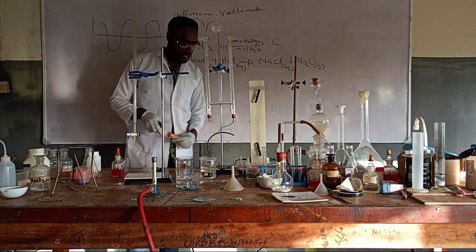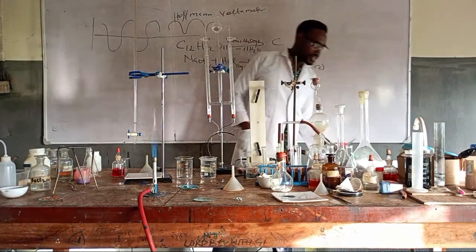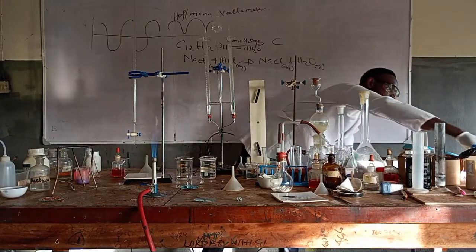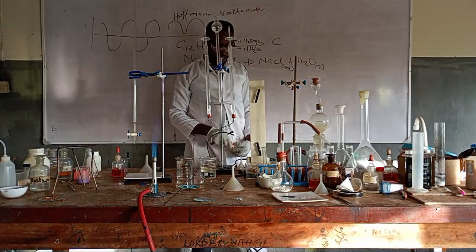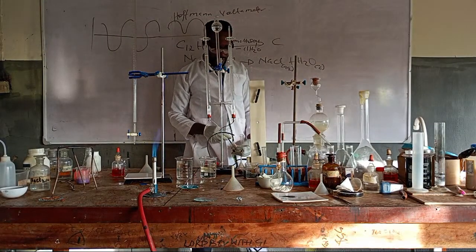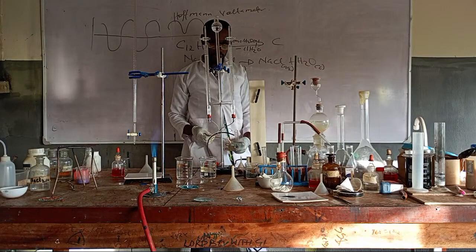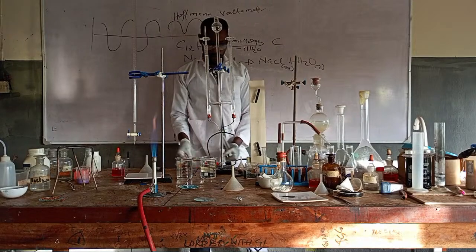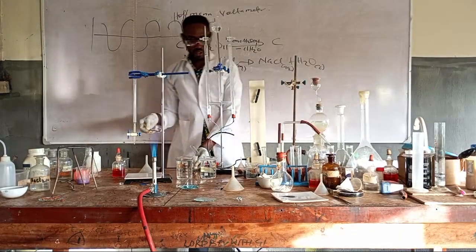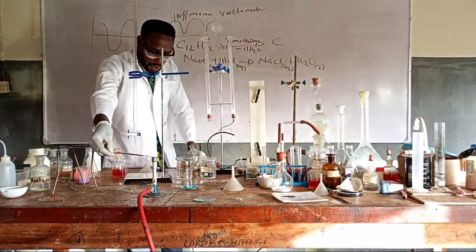Funny, I can change this flame to green. I hope you know. Do what? Change it to green, the flame. Please, I warn you that when you come to chemistry, stop saying that you cannot. After warning you, still talk nonsense. I just want to entertain you. It's not because you said you cannot.